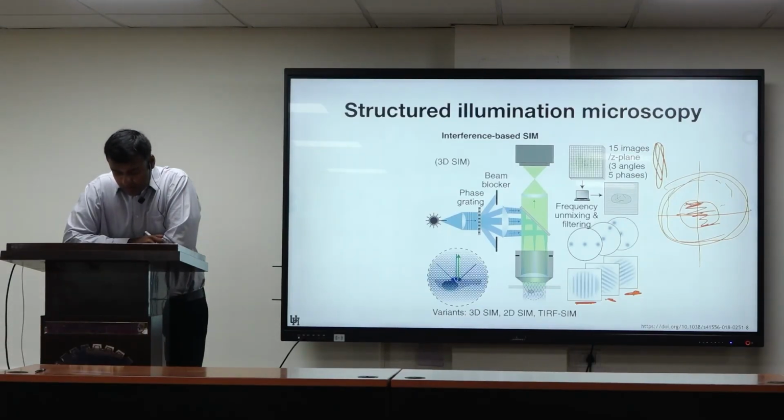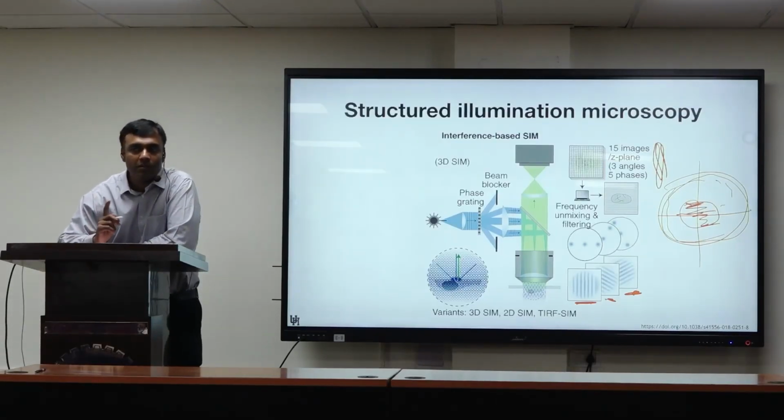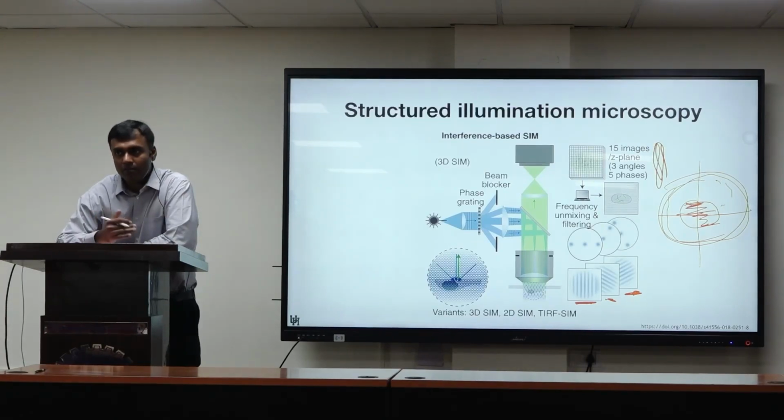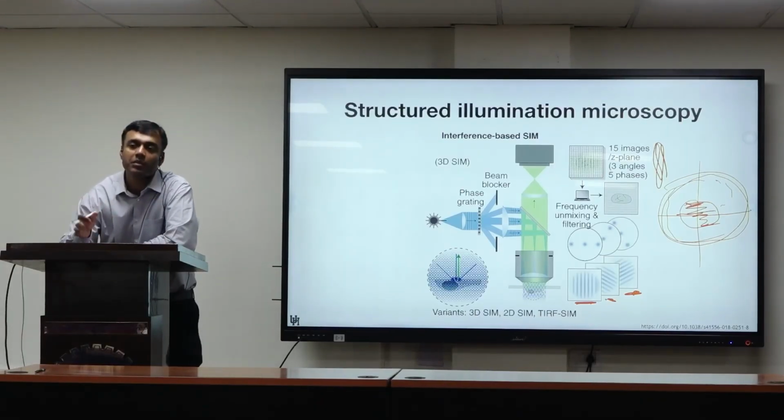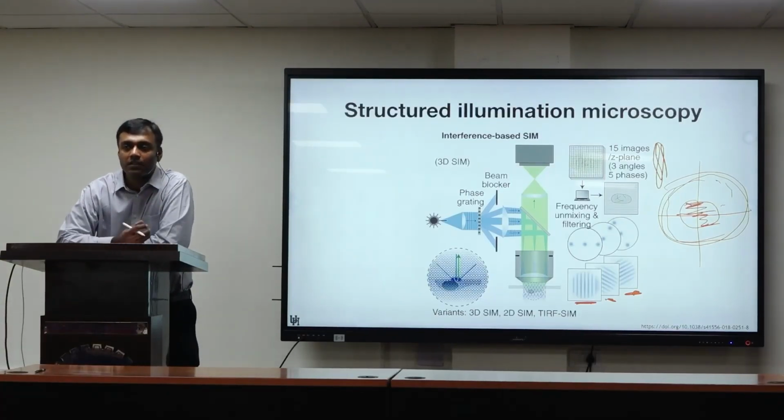Not quite. The cost is you are getting not one image but six or more images. You have to take 6 images to get that resolution instead of taking one image. Penetration depth is not affected. Correct, penetration depth is the same. The penalty you pay is that instead of taking one image, you have to take multiple images and do some computation to recover the better resolution data.